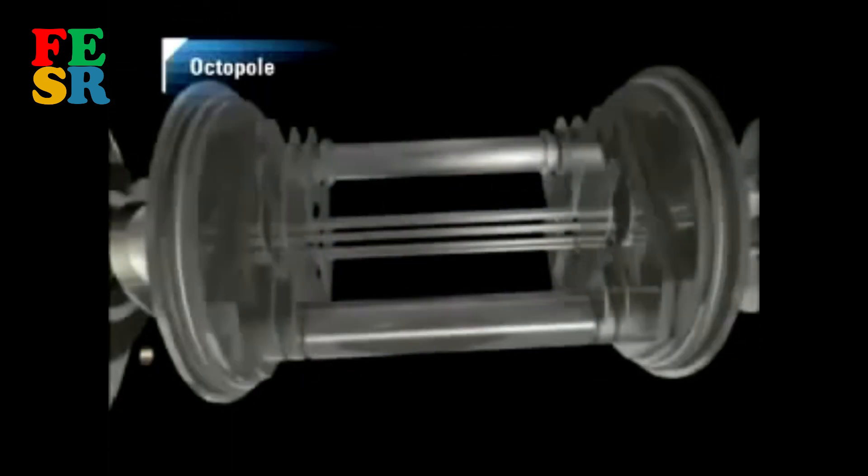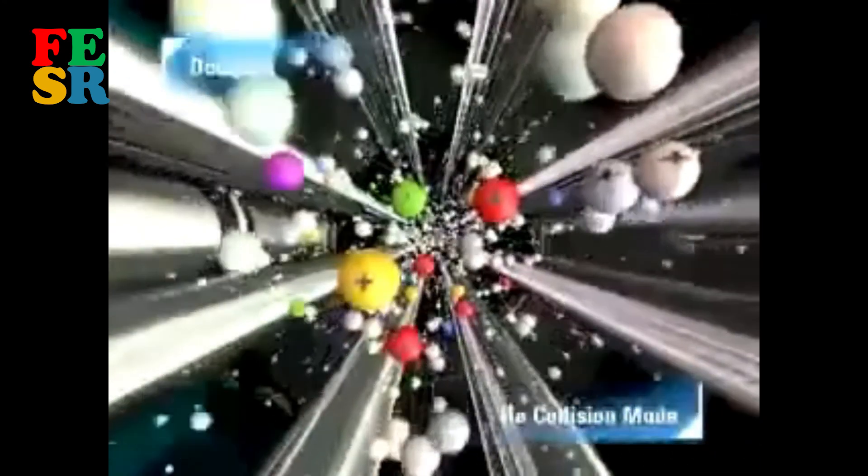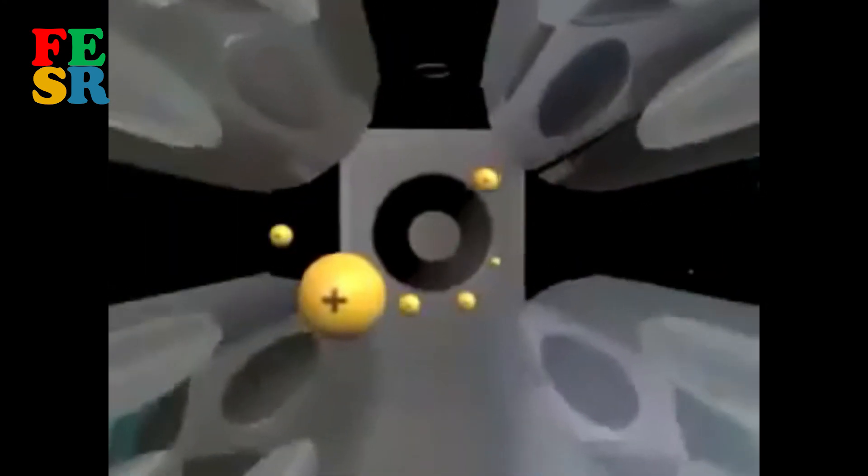The 7500 CE with octopole reaction system sets a new standard for ease of use, accuracy, and productivity in routine metals analysis, with its unmatched interference removal capability, high sensitivity, and wide dynamic range.